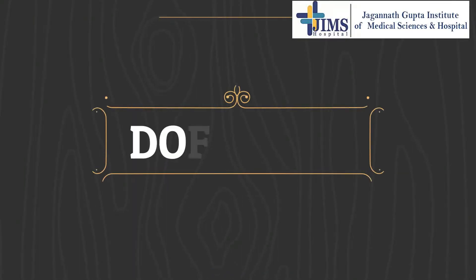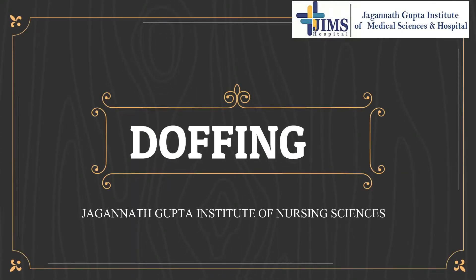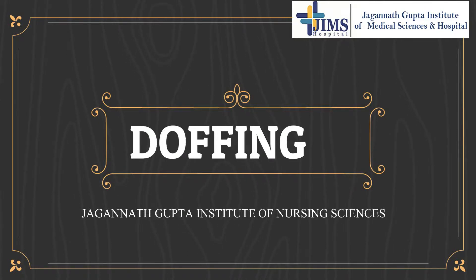In this session, we are going to demonstrate doffing. This video is for Jagannath Gupta Institution of Nursing Sciences, for educational purpose.